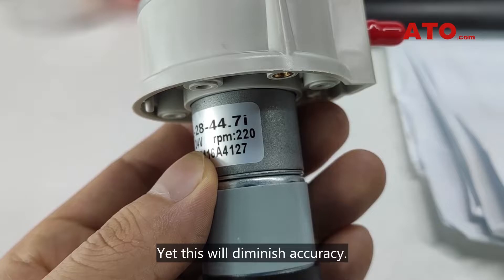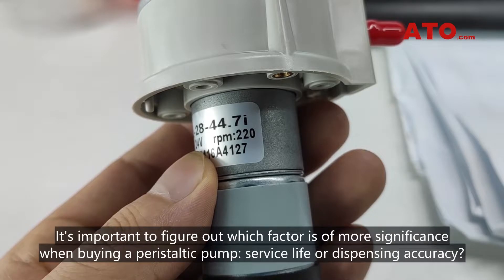Yet this will diminish accuracy. It's important to figure out which factor is of more significance when buying a peristaltic pump: service life or dispensing accuracy.